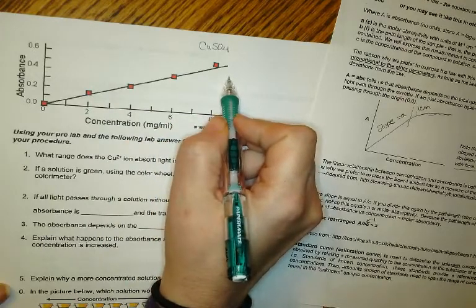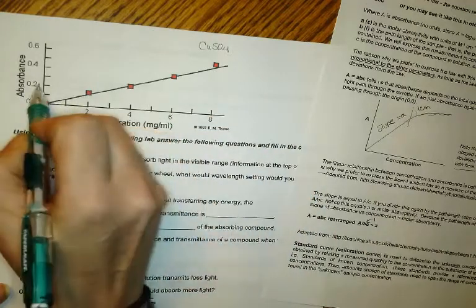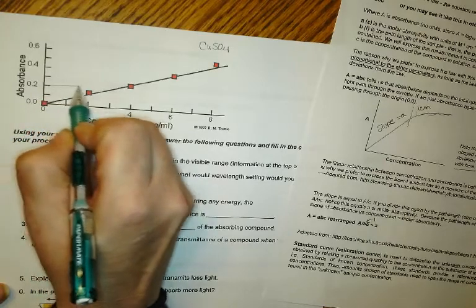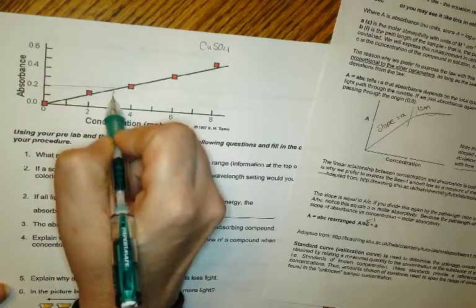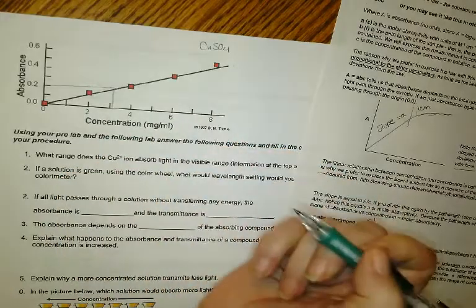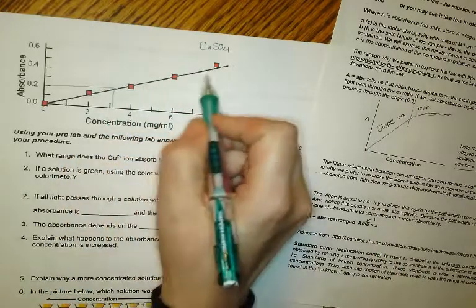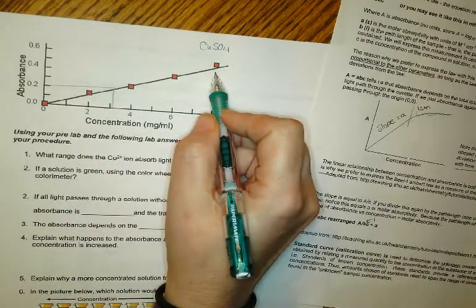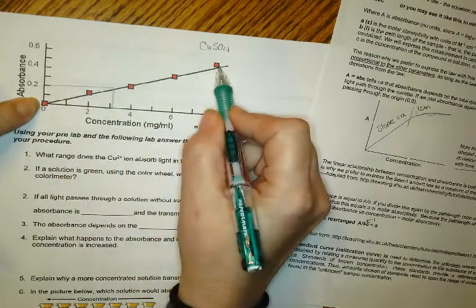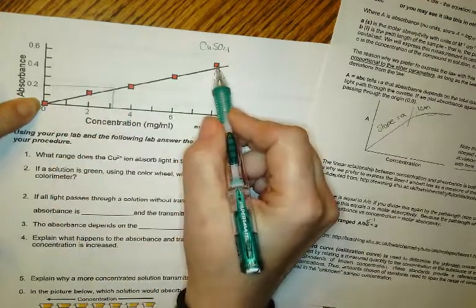And because these are known quantities, I can now take an unknown, and you could even tell by color that my unknown would be less concentrated than our most concentrated sample. And if I take the absorption of that unknown, and let's say the absorption is 0.2, I go over, and I can find the concentration was somewhere around 3 milligrams per milliliter. Okay, so our standard or our calibration curve is a curve that covers anywhere an unknown might be, between 0 to the most concentrated.